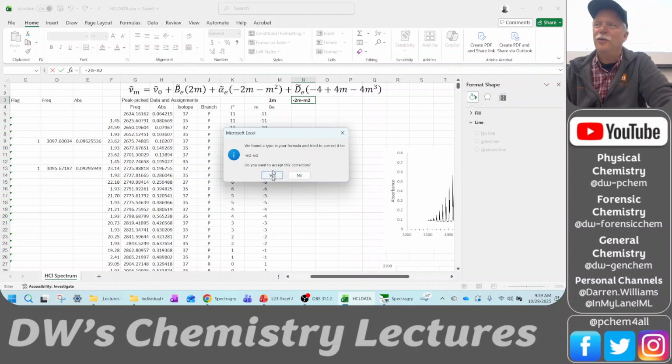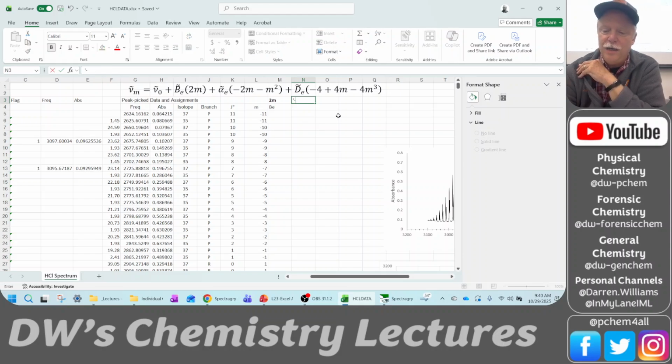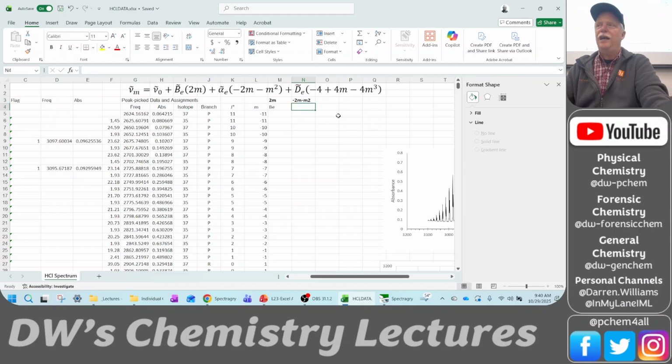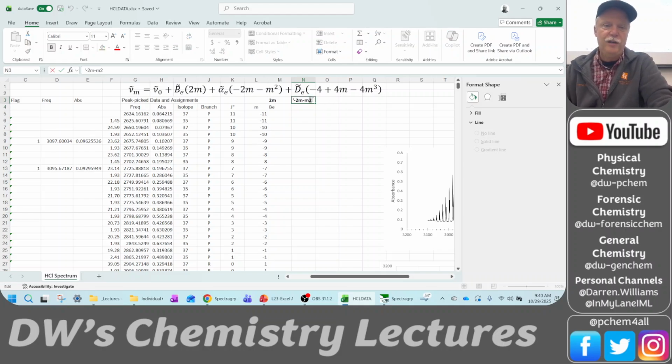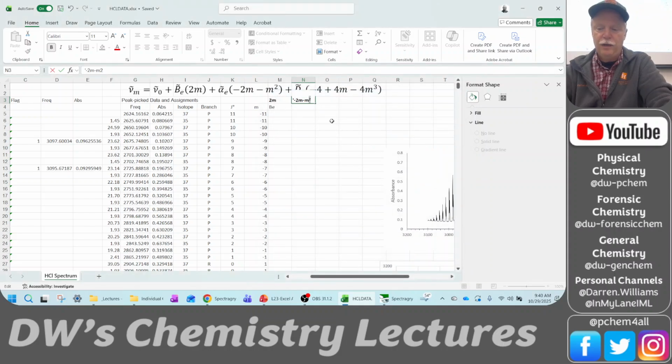Oh, it thinks I'm putting in a formula. Okay, so it says that's 0. So sometimes if you want to start with a minus sign like that, and it doesn't know what M is, you have to put an apostrophe. I'm going to do apostrophe minus 2M minus M squared, and then it knows I'm putting in text. So that's a nice little pro tip there. If you wanted to make this square, you could go in and highlight the 2 and do the font and the superscript. That's not required, but it is pretty.